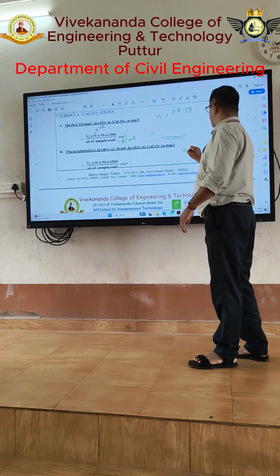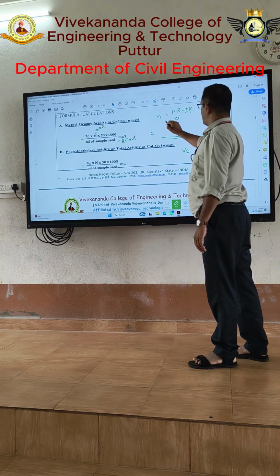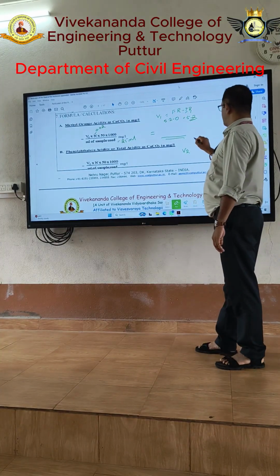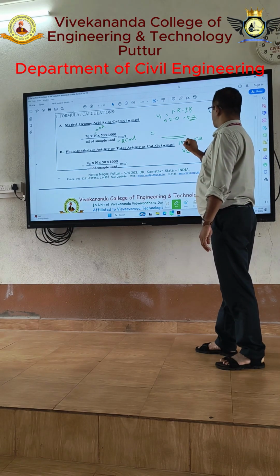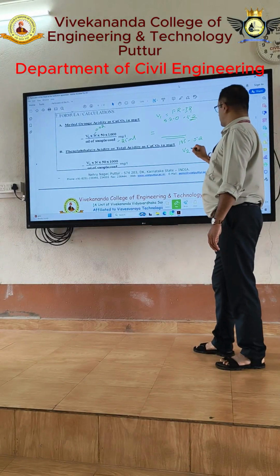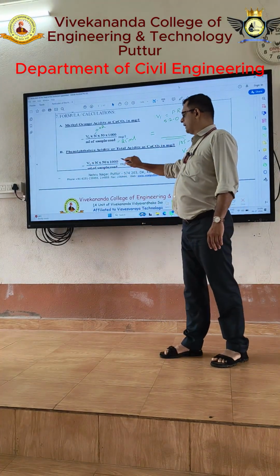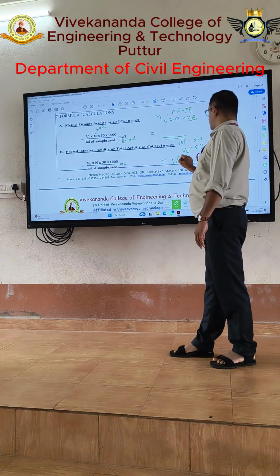Similarly, what is the value for V2? Say for example it is 0, 5.2 minus 0 is 5.2. Right, here the initial reading is 5.2, say the final reading is 10.5, then 10.5 minus 5.2 is 5.3, that is V2 here, and N is once again 0.02, 50, 1000 and 25. Note down the value of V2.